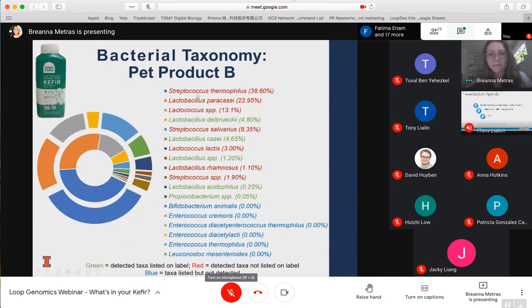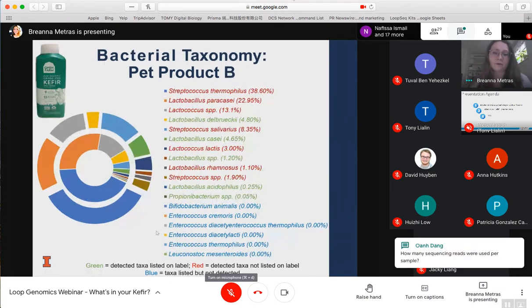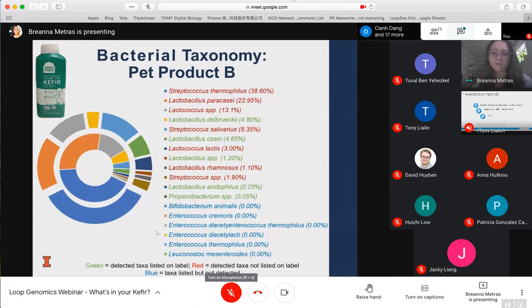This one, the top 3 abundant bacterial species were not listed on their label. We do have Lactobacillus debrueckii and Lactobacillus casei claimed, but you can see those are only around 4 to 5% of the total content. The other ones are a lot more predominant and should definitely be listed. You can also notice at the bottom there's a good amount that were listed on the label but not found in the product, which would be Leuconostoc, Enterococcus, Bifidobacterium. Many people will buy in confidence, hoping that those are in that product.